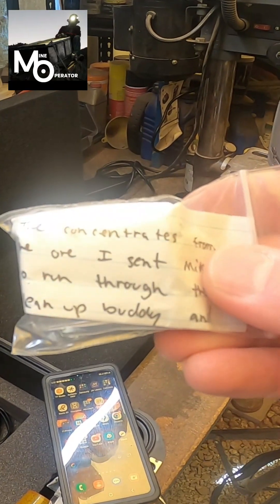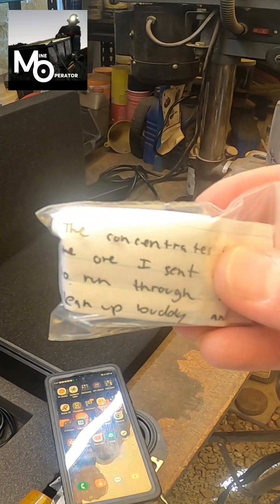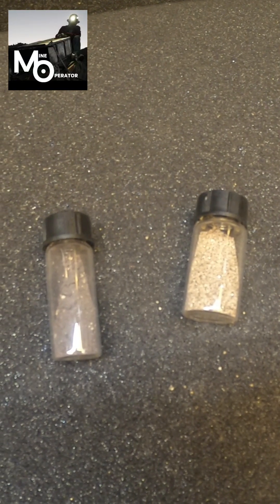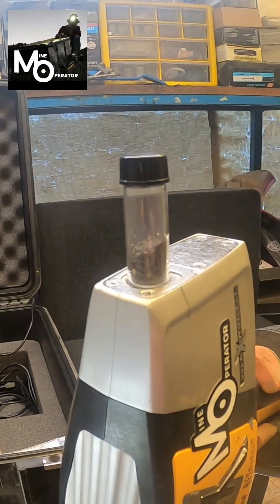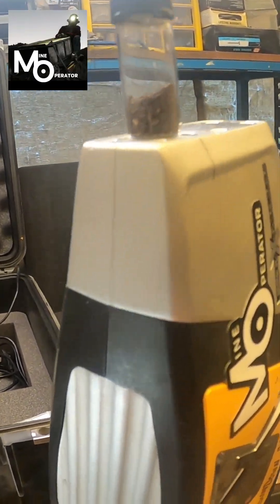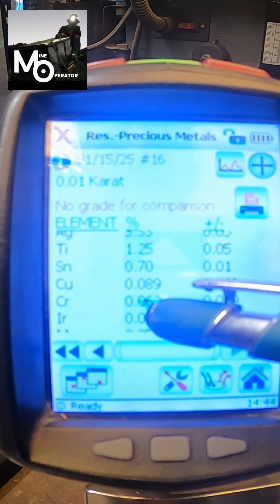The first sample up looks like some concentrates and some vials. We are going to start with the sample on the left that looks like charcoal. I will use the XRF to test this sample in both precious metals mode and soils mode.